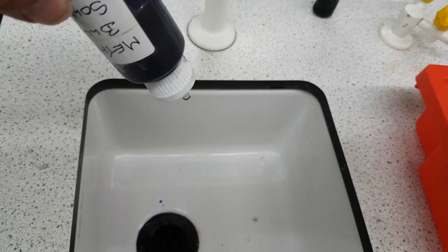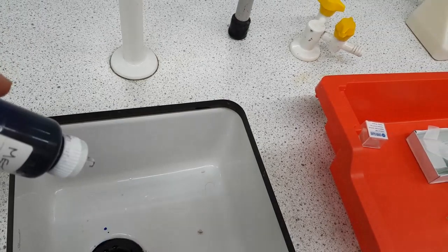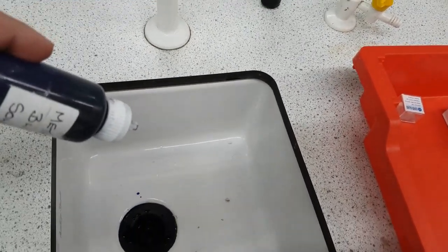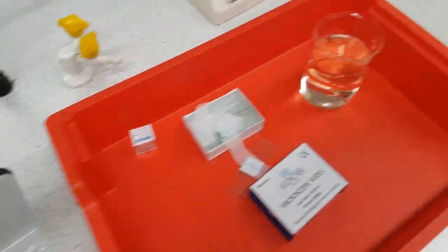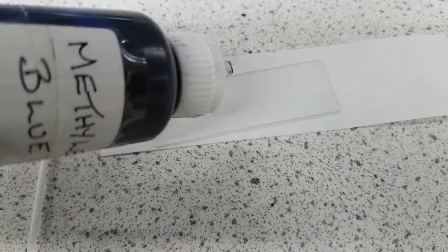So I now kind of figure out how much pressure I need to put on in order to get one drop of methylene blue out. So go back to your slide and where your cheek cells are you're just going to add one drop of methylene blue.